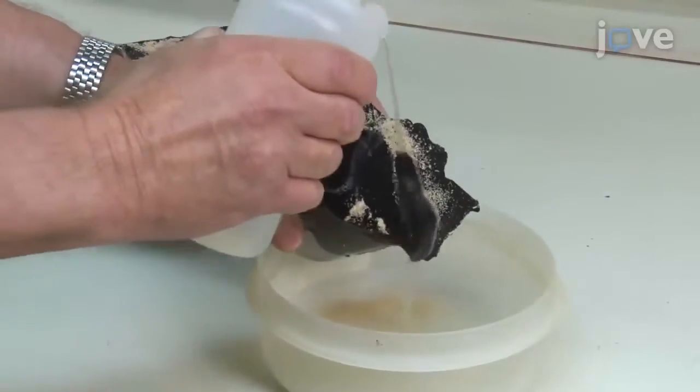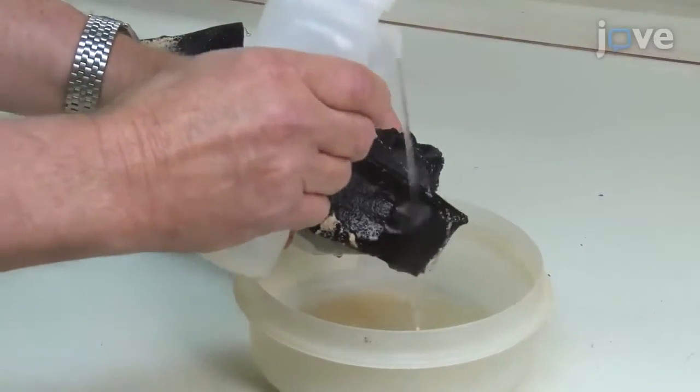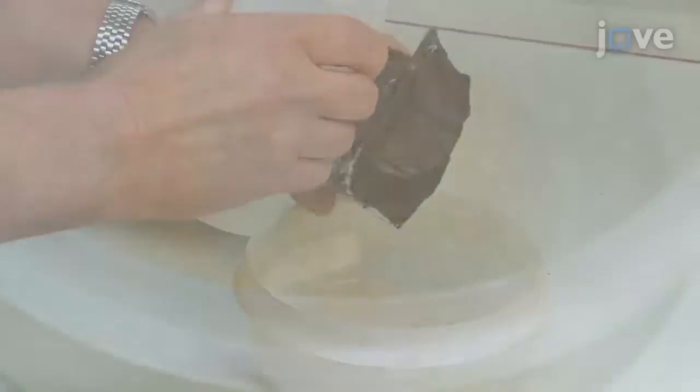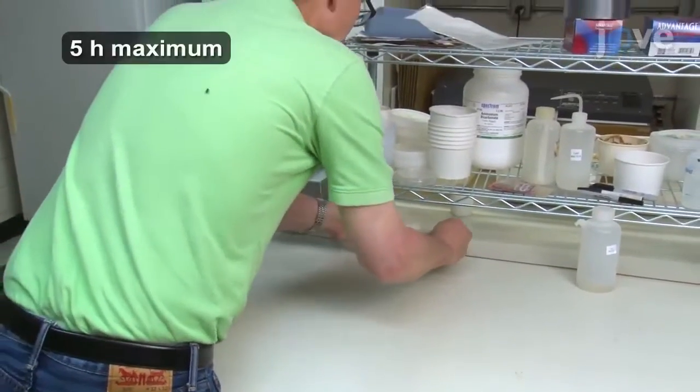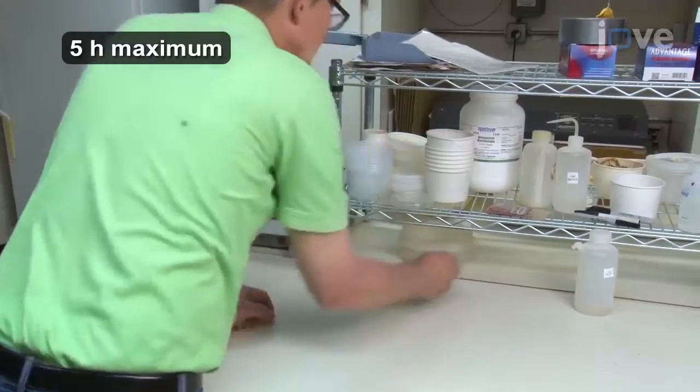Next, using water, rinse the eggs off the egging cloth into a small, empty dishpan. Theoretically, eggs can survive in water for 8 to 12 hours. However, it is best to limit the time to 5 hours or less.